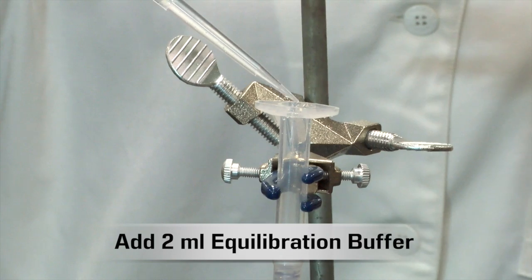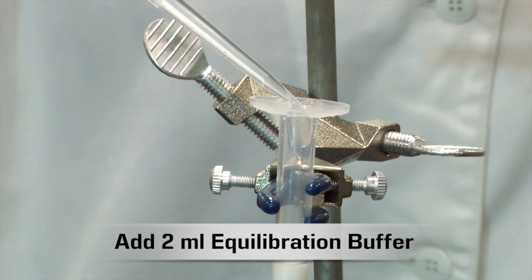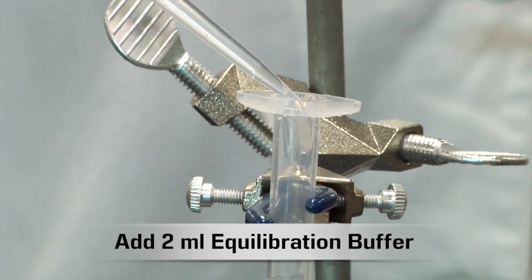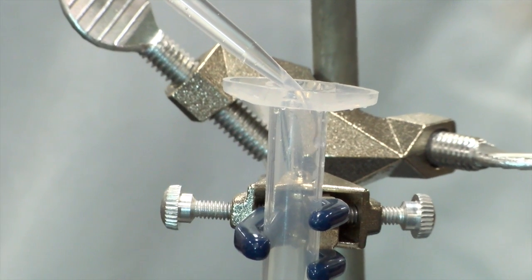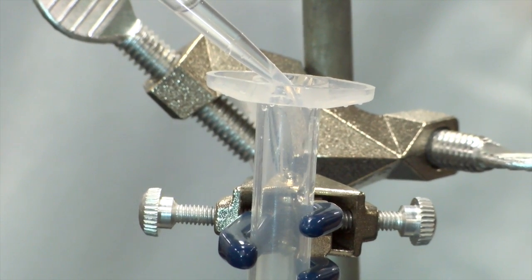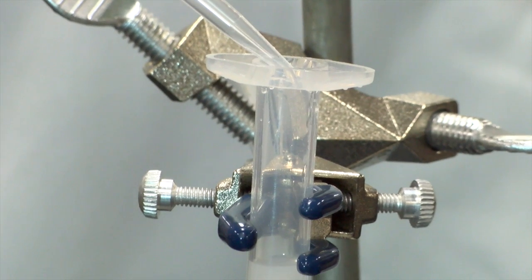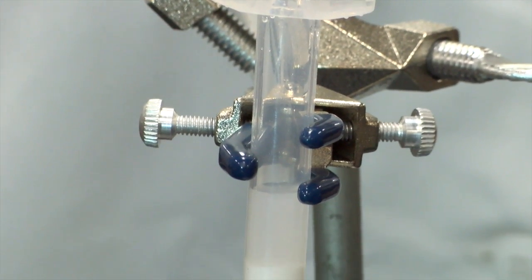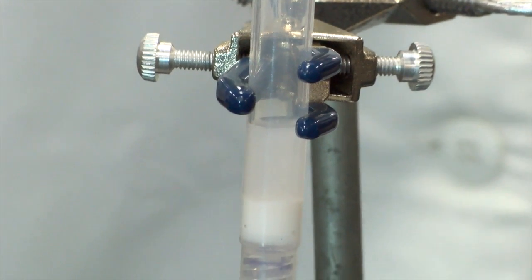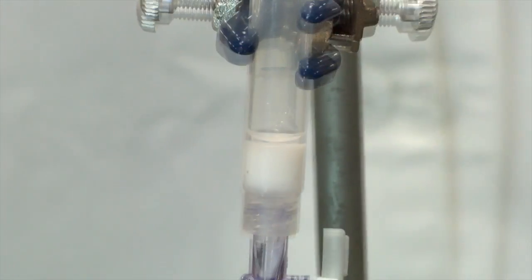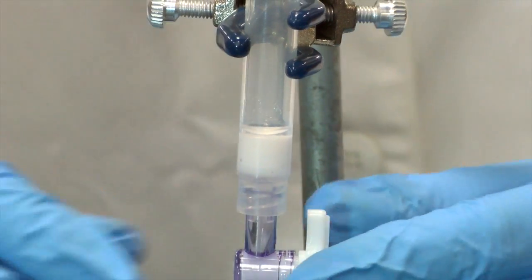Slowly add 2 mL of equilibration buffer to the wall of the column near the top so that the resin bed will not be disturbed. The equilibration buffer ensures that the resin beads will be at the same high salt concentration as the protein sample. Allow the buffer to flow through. Be sure to close the valve when the liquid is just above the resin bed.